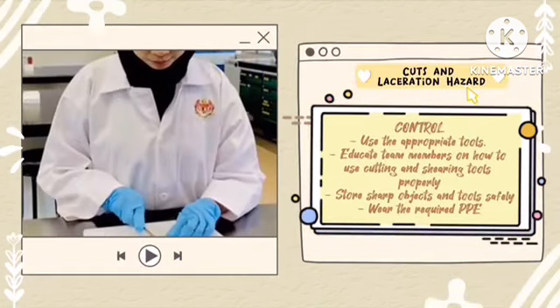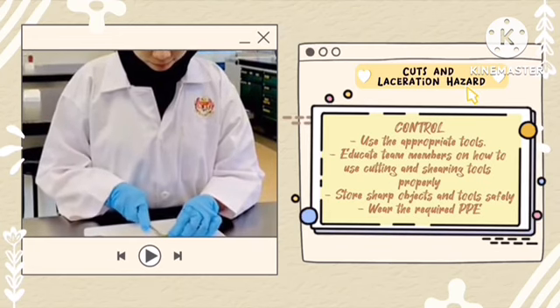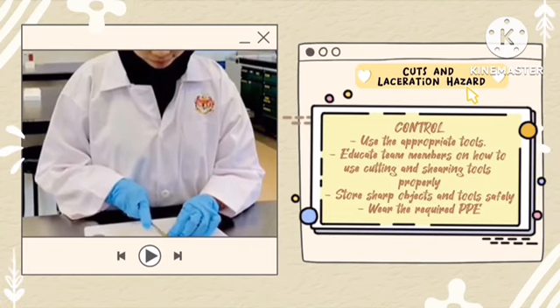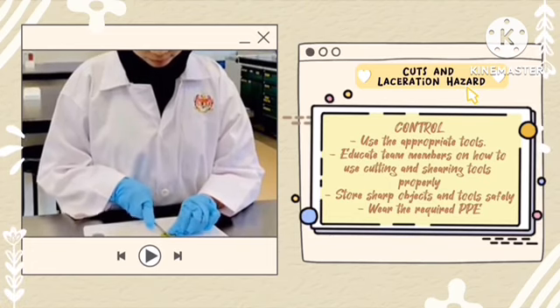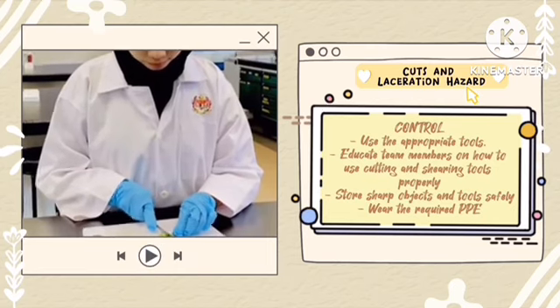For the control, we recommend using the appropriate tools and educating team members on how to use cutting and shearing tools properly. When not in use, store sharp objects and tools safely. After all, we must wear the required PPE including gloves, lab coats, and masks.